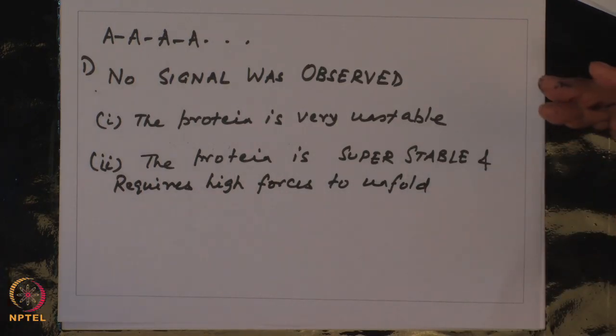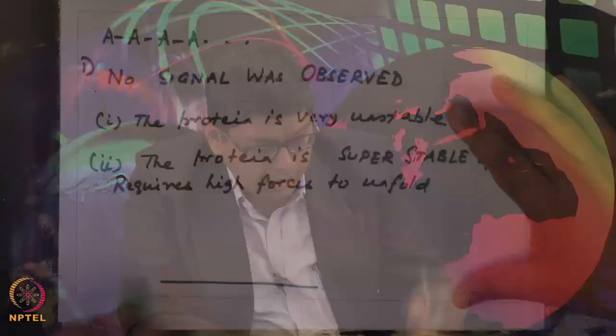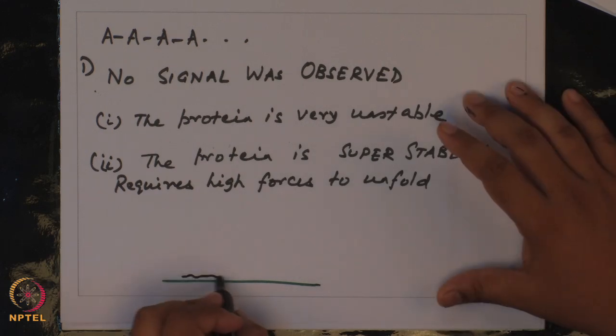This is somewhat counterintuitive. So, if we know that the protein is stable, why are we not able to detect it? The reason is as follows. You have your substrate and your protein is anchored.